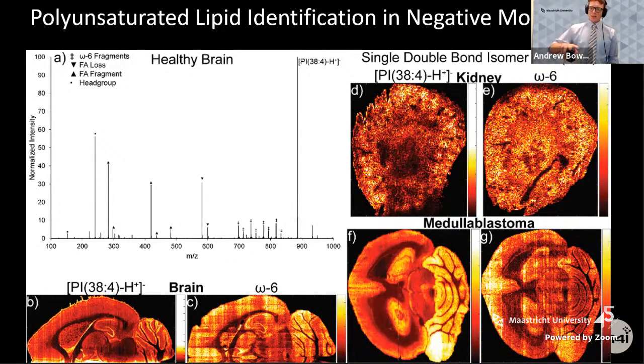And you're able to detect differences in the overall picture of what you think that lipid looks like with the lower resolution MS1 that you see in this versus, say, a 21T instrument, but you can detect the specific fragments of the omega-6 for, say, PI 38:4 and see how that is significantly different in the kidney or how it follows a similar, if slightly less clear, image in normal brain.